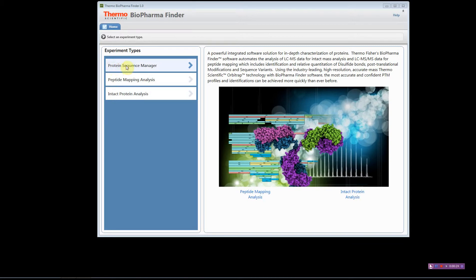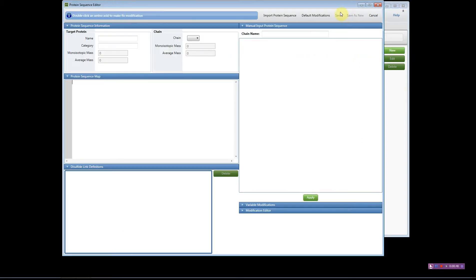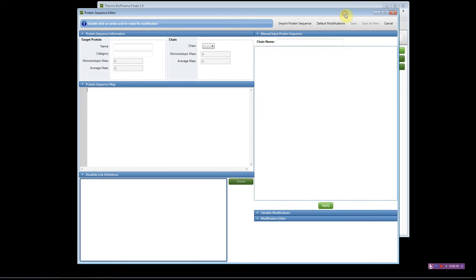Click there and the Protein Sequence Manager page will appear. If you have proteins already loaded into the software they'll show up here in this table. To add a new protein, click New and the following box will appear.